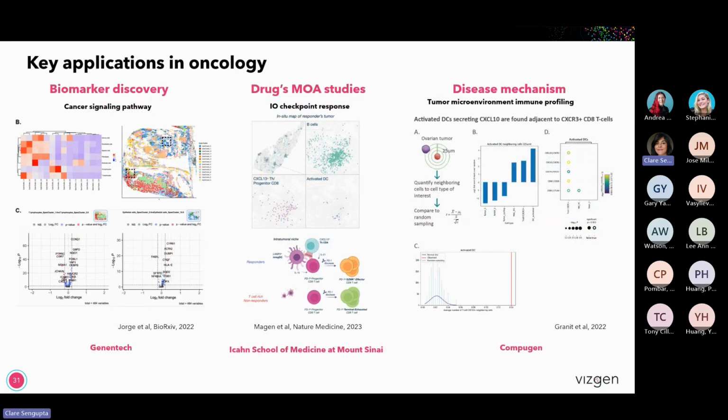So we don't just have a lot of high profile, interesting publications available for neurology and neuroscience research, but also many applications in oncology as well. So once more, we'll get more into the left-hand panel in the next slide. I have a whole slide breaking this down. But essentially, Merscope is used to study cell distribution and interrogate gene expression pathway in lung cancer in that study.